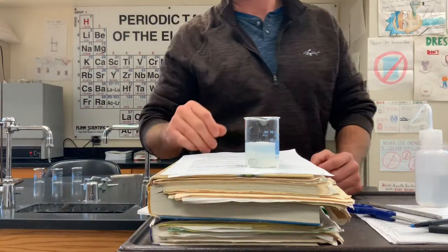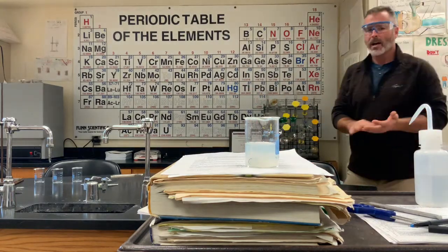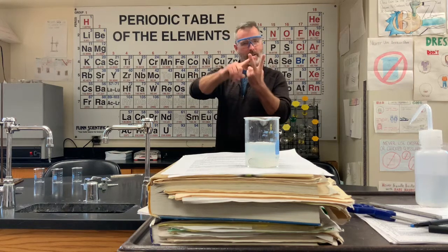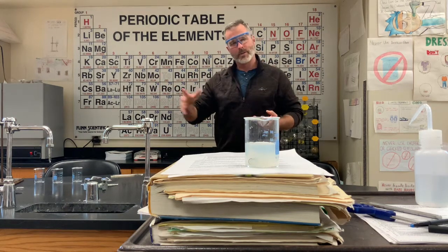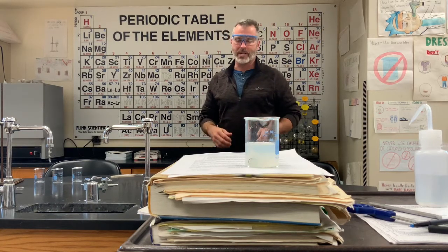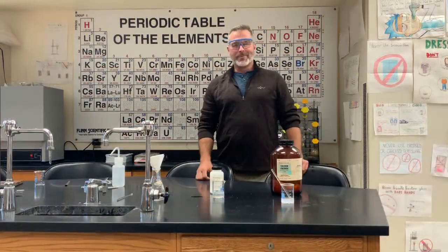We're going to throw it in there. We're going to let it sit for five or six minutes. Upon that, we should see the silver nitrate reacting with the copper wire to form two more products. We'll get a picture of what it looks like after it has completed reaction. Alright guys, we're back with demo number two.